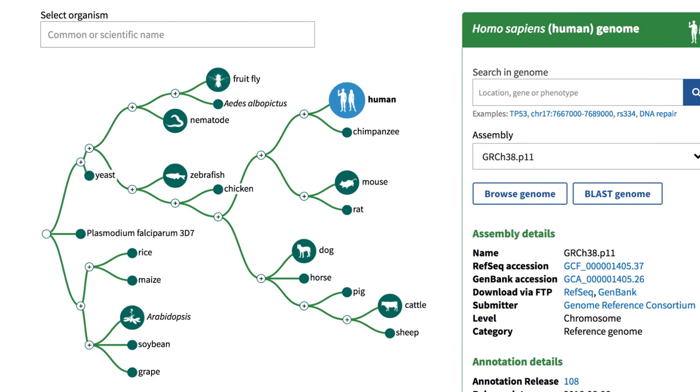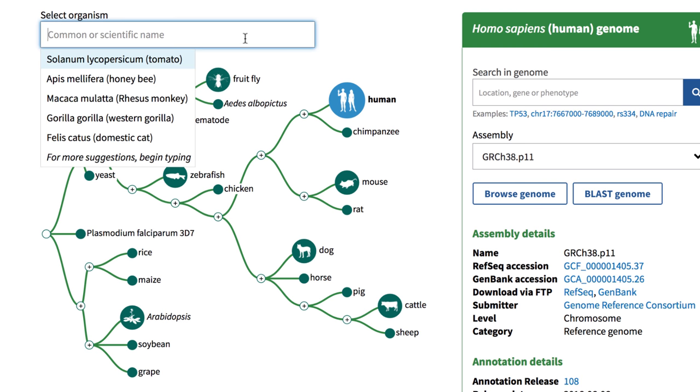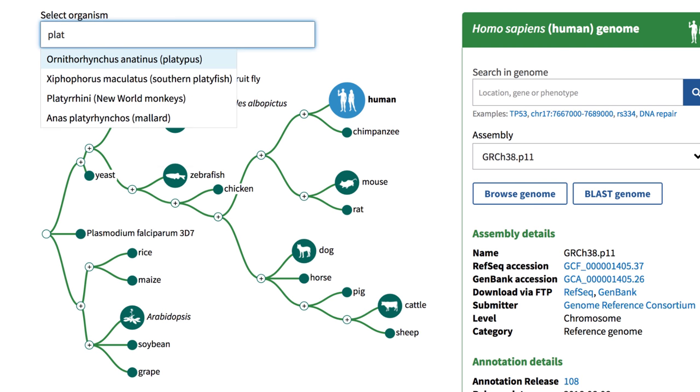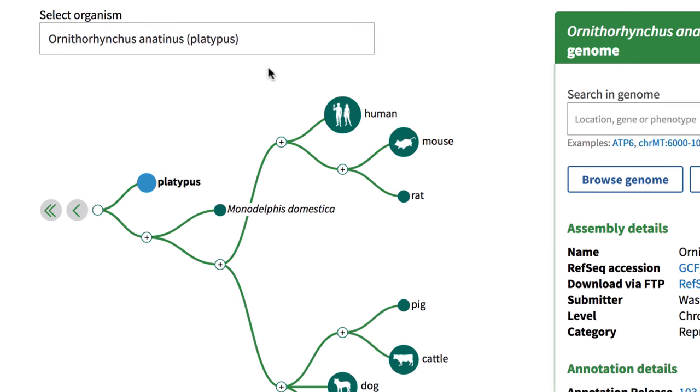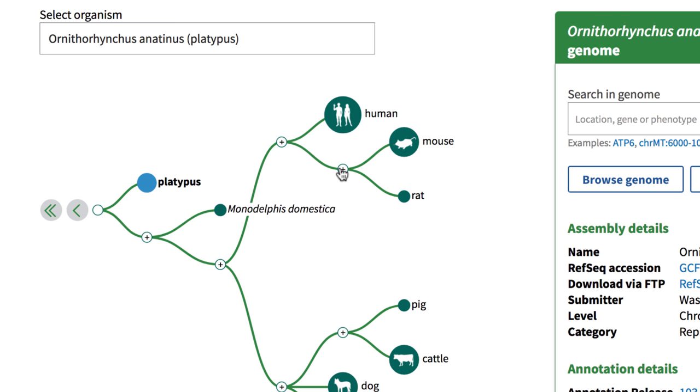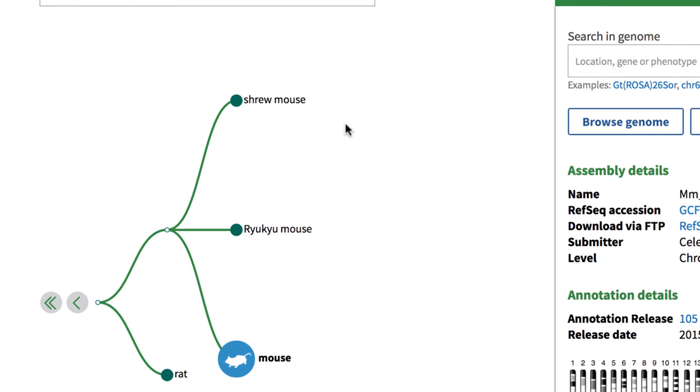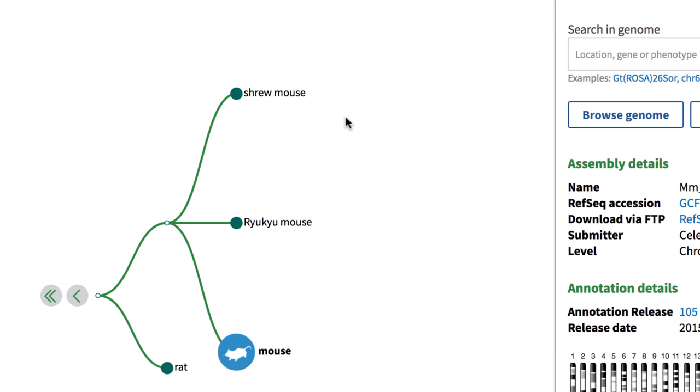On the viewer's homepage, you may find your organism of interest, or use a common or scientific name to quickly search for an organism, or explore what other organisms are available.